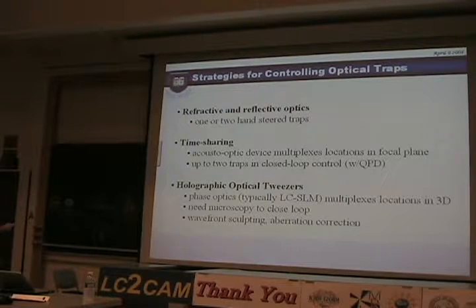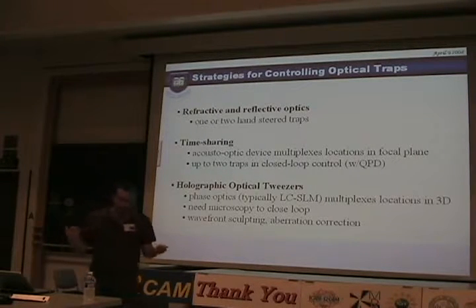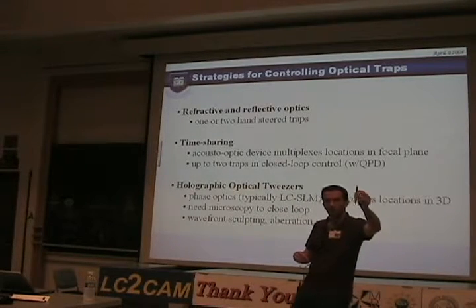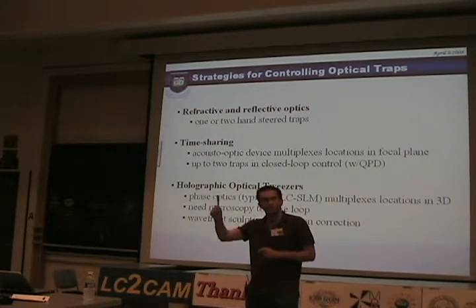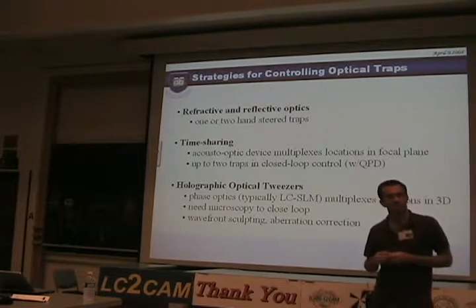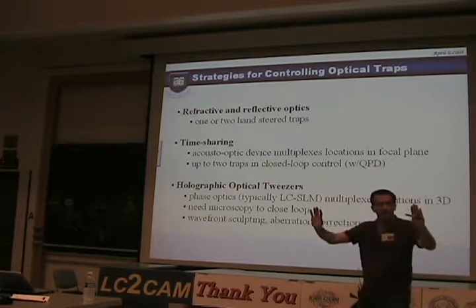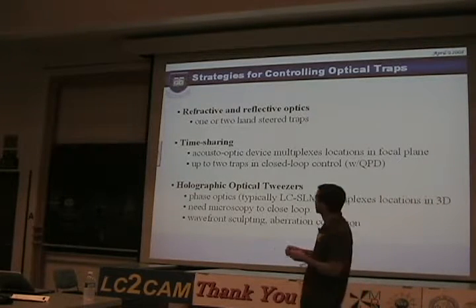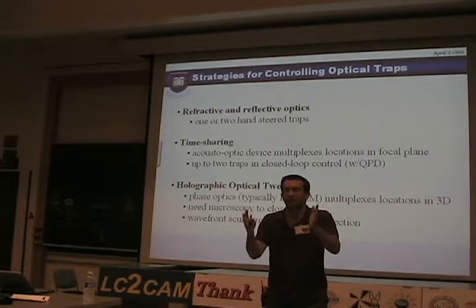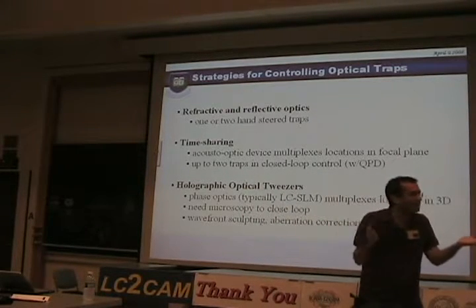The most popular optical trapping setup today is based on time sharing. If you want to make multiple traps, you take a single laser beam and have it sit in one spot, and then hop over to another spot very quickly. If that switching back and forth is faster than the particle's native dynamics, then it sees a time average.